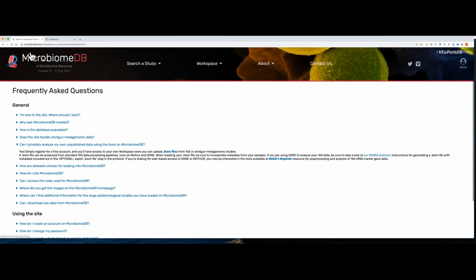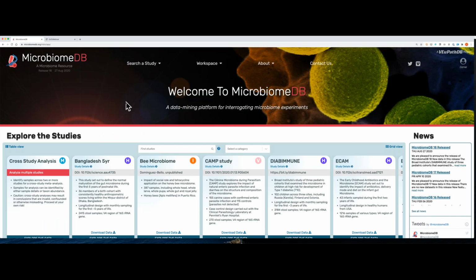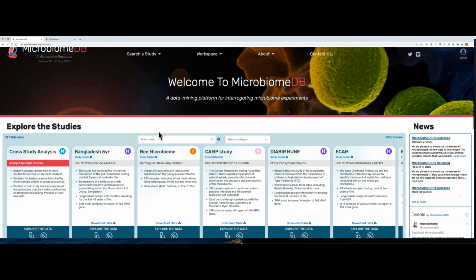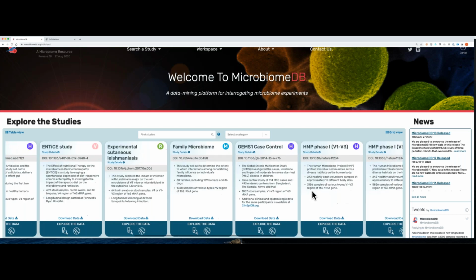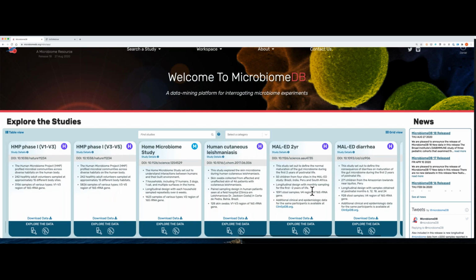so I guess two things I would say. You should always make your raw data available, and that's often a requirement of publication. And we do not host raw data files so that users can come to our site and download them. In fact, if you click these download data links, you're not getting the raw FASTQ files, you're getting text file summaries of the microbiome composition from those samples. So you would still want to have your data on the sequence read archive or on ENA or one of these data repositories.